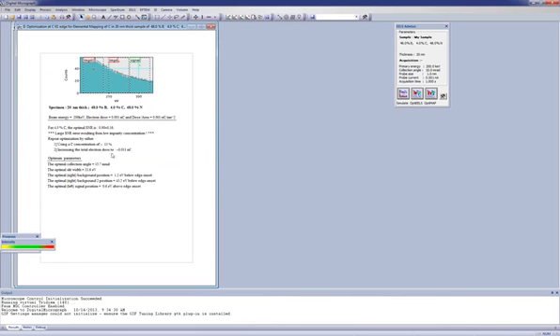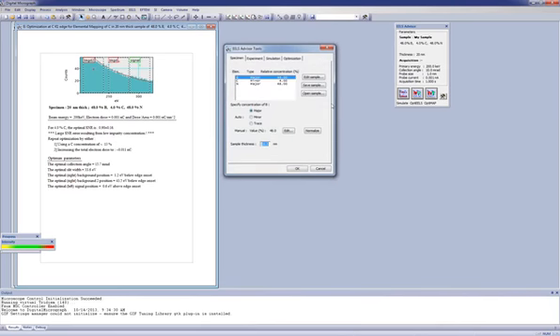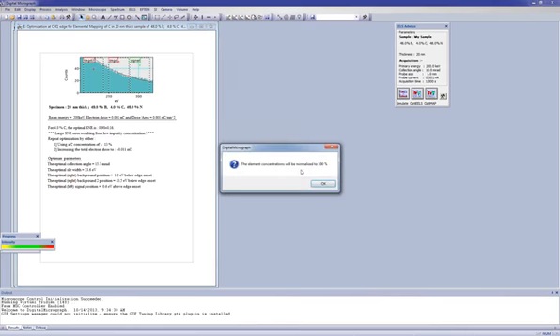And it suggests in this case that the signal-to-noise ratio is quite small. We have a small signal-to-noise ratio resulting from the low impurity concentration, and we may have to repeat the optimization by using a larger concentration. So we can go ahead and do that. Hit the Tools button, hit Edit Sample, or change the sample concentration. You can hit carbon at 15%, hit OK.